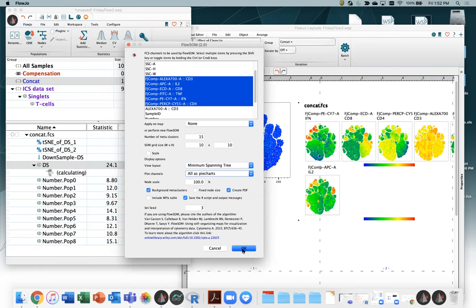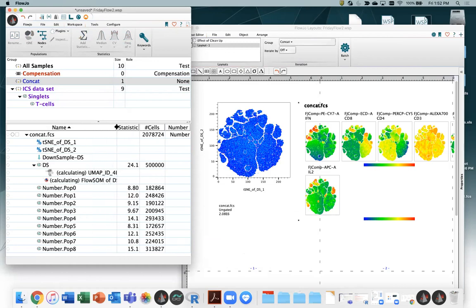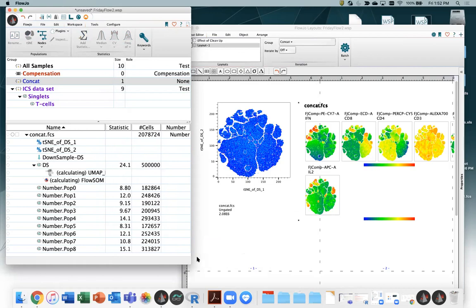So I'm gonna say okay and see what happens here while we're trying to calculate two things at once, while also doing a screen share. So we're being brave.